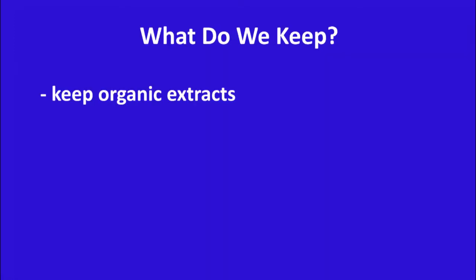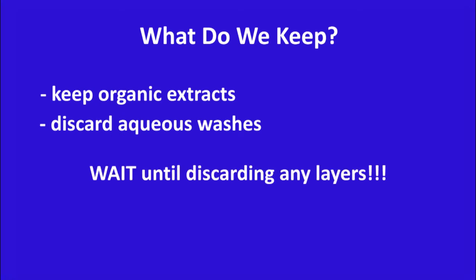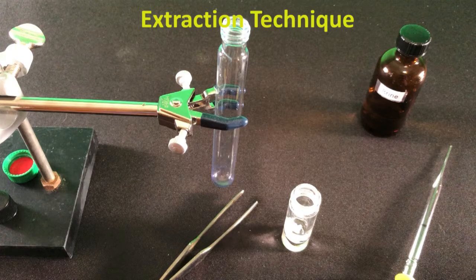Keep the organic extracts, but discard the aqueous washes. However, wait until the end after you are 100% sure you have product before discarding any layers. How will we do this?